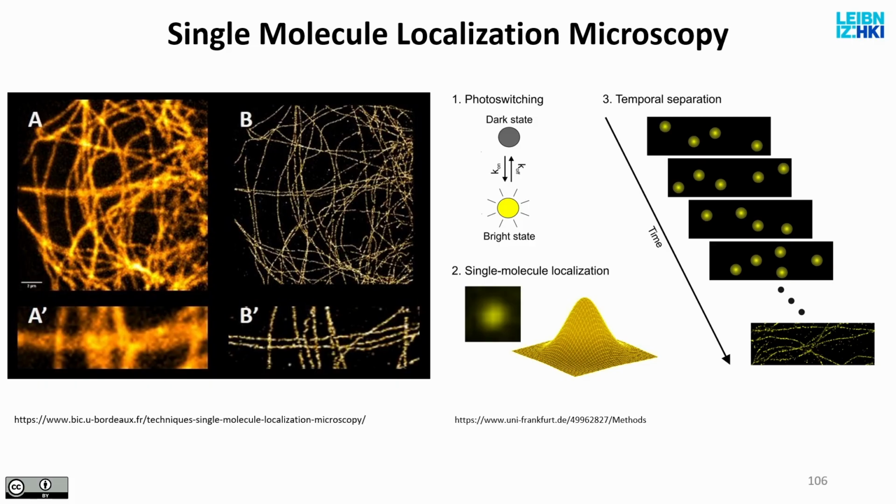What determines the Gaussian width? Or the quality of the fitting? The number of photons. So if I observe the sample long enough, like I collect 10,000 images, I will have my desired super resolution based on individual molecules. And that's it. That's what I want to tell you about microscopy.